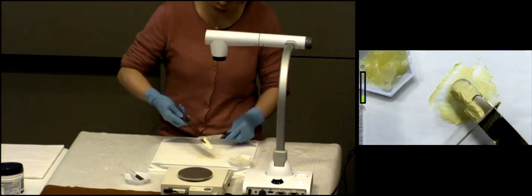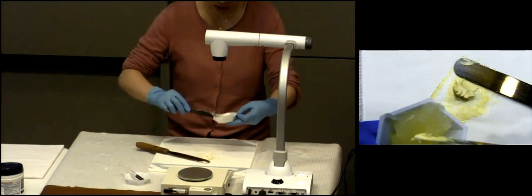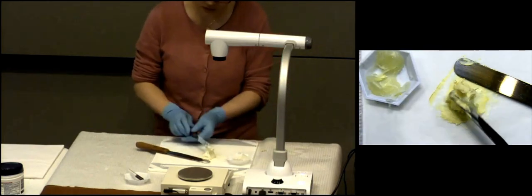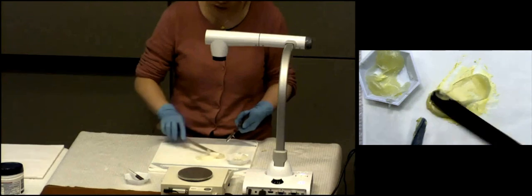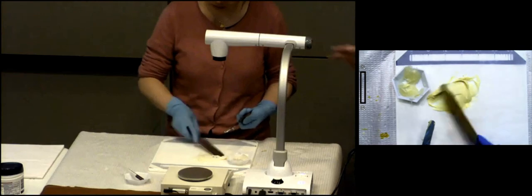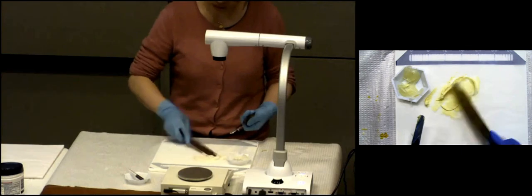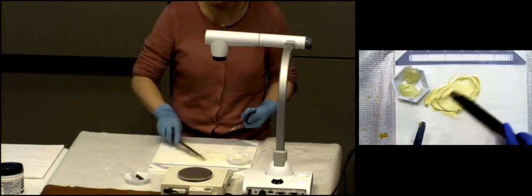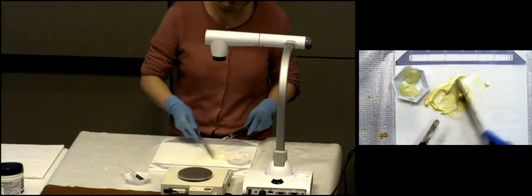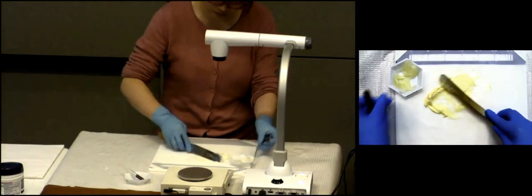All right, guess what? These 2 spatulas can help each other. So another 1-to-1 ratio. Let's add a little bit more. I want to use my larger spatula. Now, how come she's not spreading it out across the whole parchment paper? Why is she just sticking right there in the middle? Ish. The more slathering around the paper you do, the more loss there is. While you can certainly spread out as you need to, try to avoid using up the entire surface area, or you will have more loss because you'll probably slather it onto the countertop too.